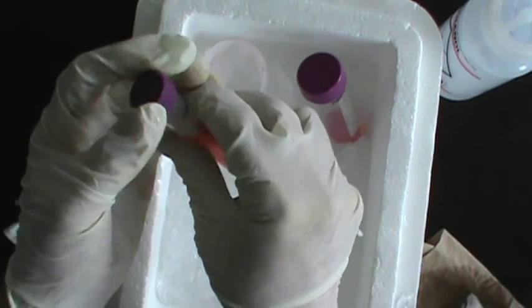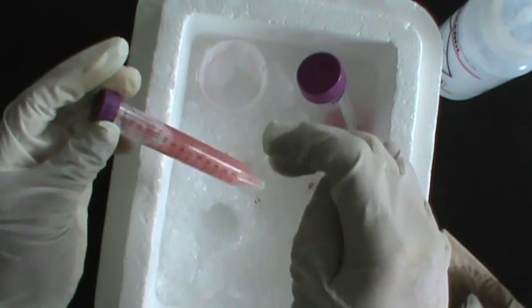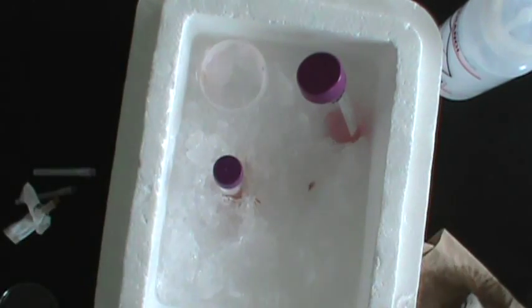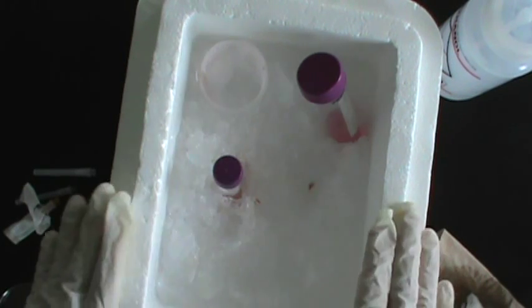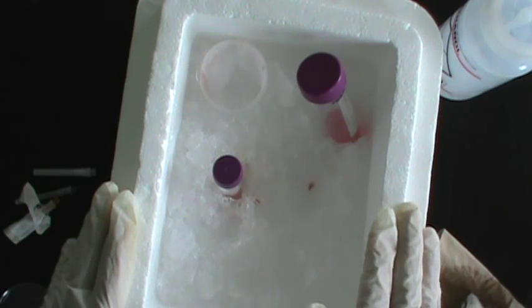At this point in time, we should have a single cell suspension of spleen cells in our culture medium in our 15 milliliter centrifuge tube. So now we're ready to continue with the next phase of the preparation of these spleen cells, which is centrifuging these cells and washing them and getting them ready for culture.